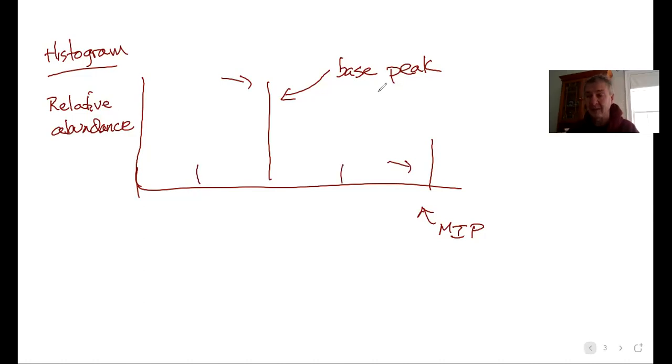Now, the x-axis, you would think it's mass, right? But here's the interesting thing you have to get your head around. Let's say your molecule goes into the ion gun and it gets an electron knocked off. But as it's traveling through, it gets another electron knocked off. Now it's doubly charged. What comes out into that accelerating vacuum is M2 plus. It's lost 2 electrons.